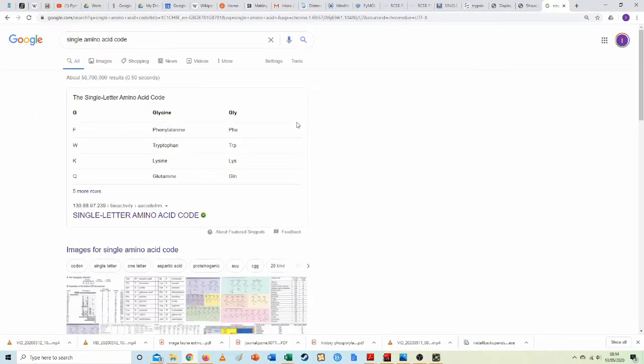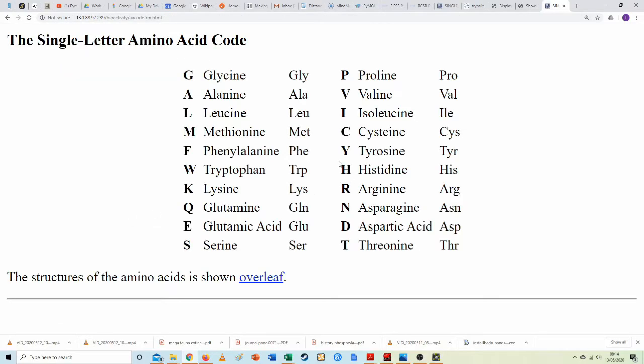As you will have figured out by that, I don't know this off by heart. If you work with this all the time, chances are you're going to know off by heart what all the letters stand for. It's basically just 5 times harder than the DNA stuff, and it's not required that you know this.